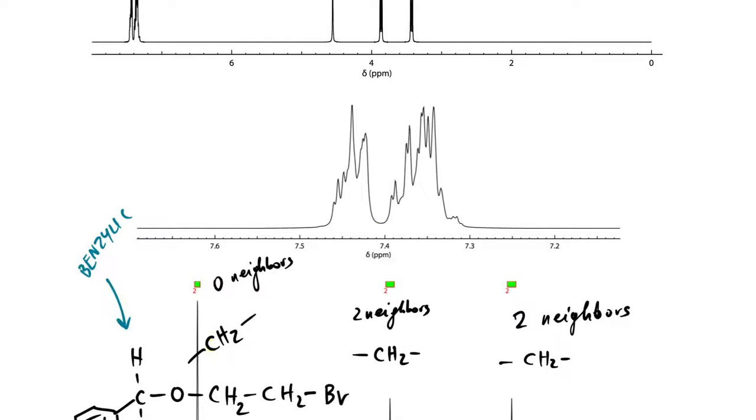You know, if you're really good at NMR, you can pick it up. And some aromatic systems that we will talk about have distinct splitting, and you can pick it up. When we start to talk about how the ring is substituted with multiple substituents, NMR will tell us. But so far, we don't talk about them. So integration and shift. Out of 3, these two will be most helpful. All right, well, let's stop here.